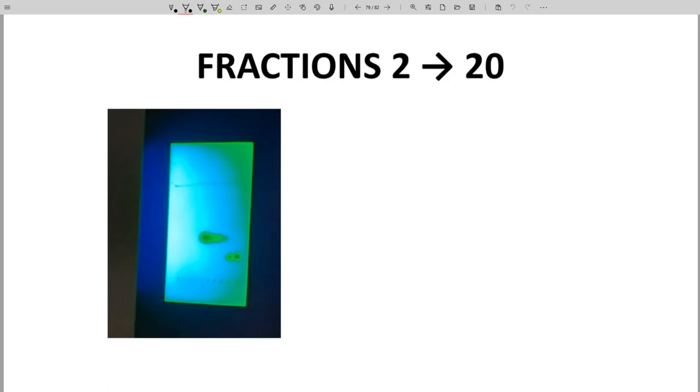Here is our TLC plate of the first 20 fractions. I didn't spot all 20 fractions. I did 20 fractions. So what do we see? Well, this looks awesome. We have a top spot, our less polar molecule, coming off in the earlier fractions. Once it finishes, the more polar material starts to elute in the later fractions. Based on this plate, I would guess the more polar material is still coming off the column. And I need to check some more fractions beyond fraction 20. The great thing is that we don't seem to have any overlapping fractions.